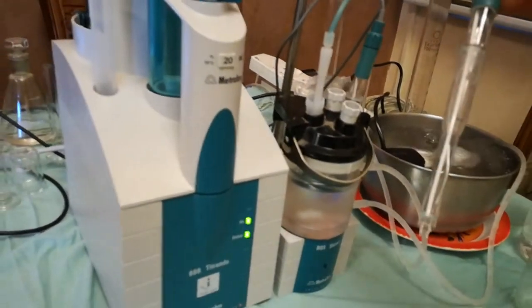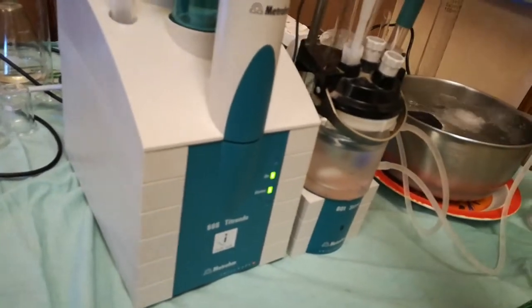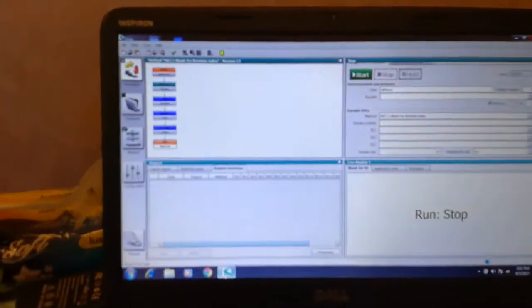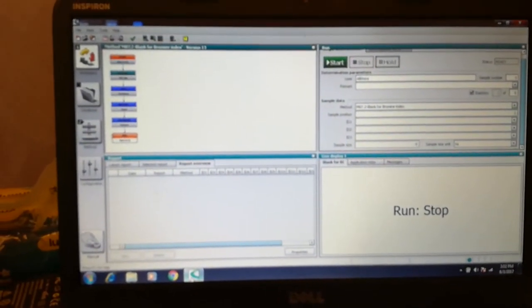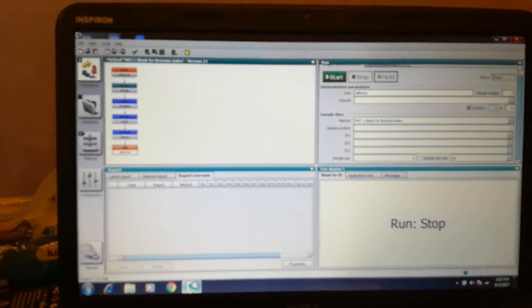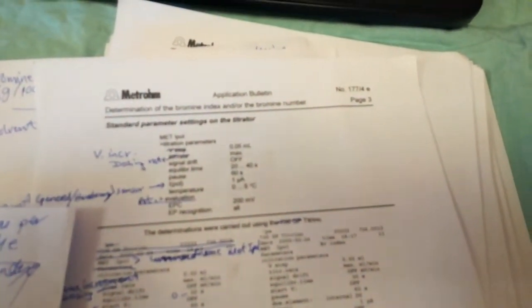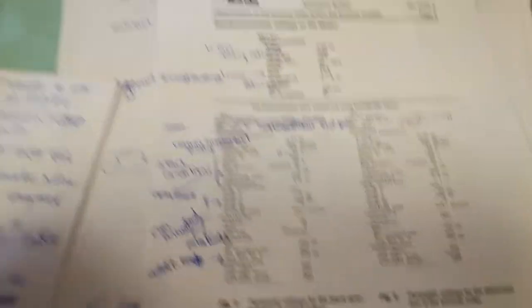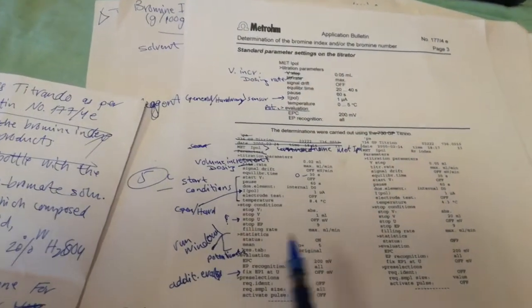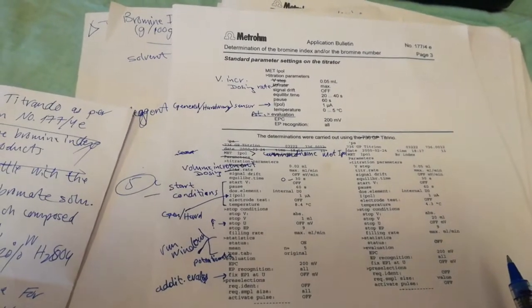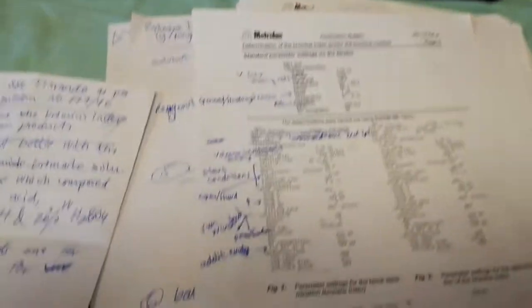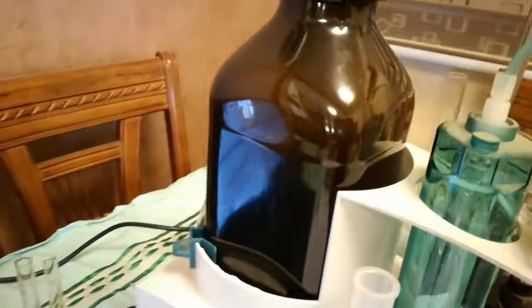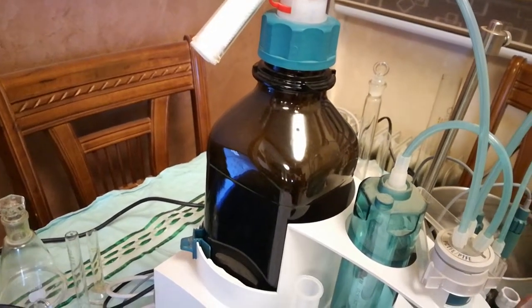Here is the software, TMO 2.3, and we're going to follow the application bulletin from Metrohm numbered 177. These are the settings for the blank determination, and this is the setting for the determination of the bromine index.